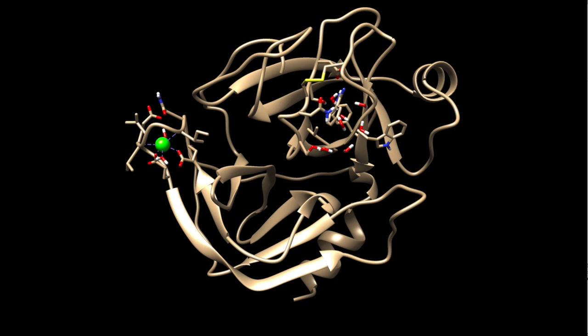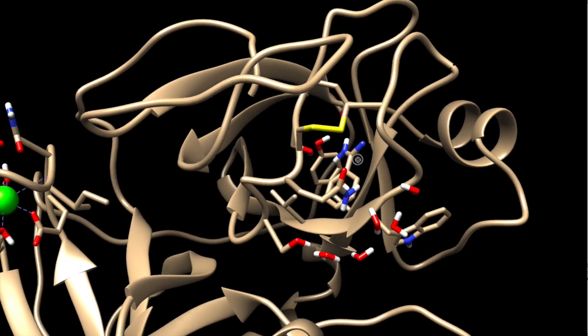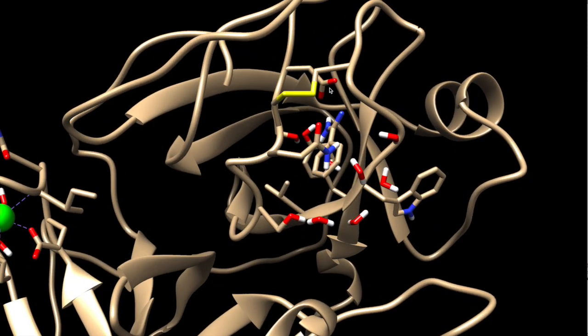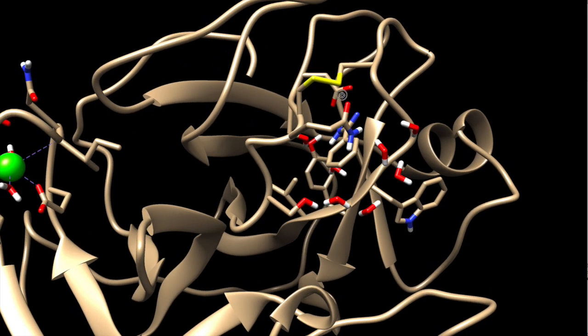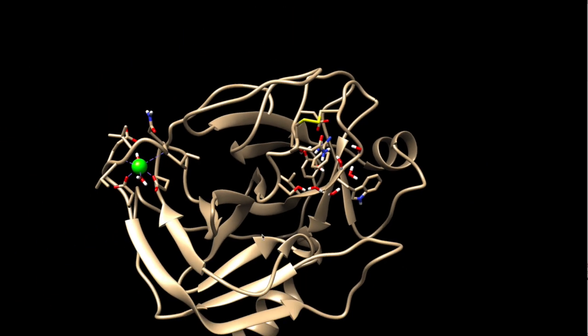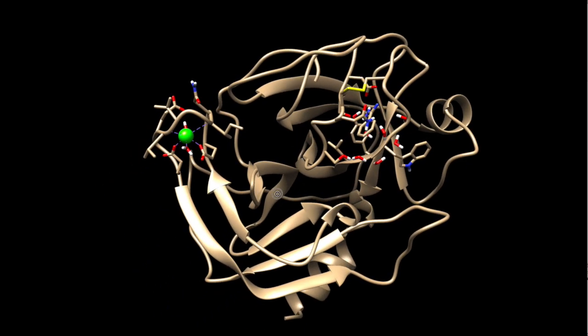Okay, active site is here. Here is the binding site for this benzamidine. You can see it forms a nice salt bridge at the end of the catalytic pocket here with this aspartic 189 residue. Now you see here that Chimera tries to show you certain ligands. For example, this is the calcium ion complex here, but it's not needed for our simulation.